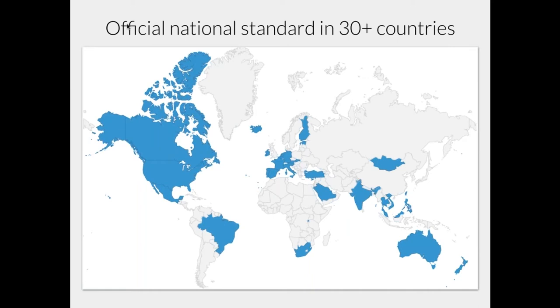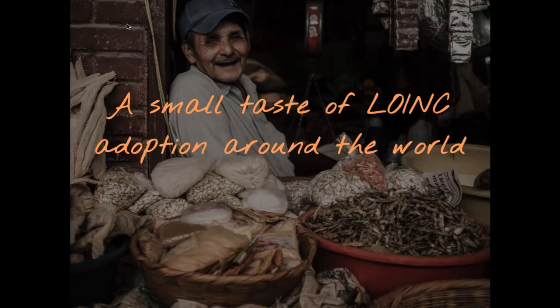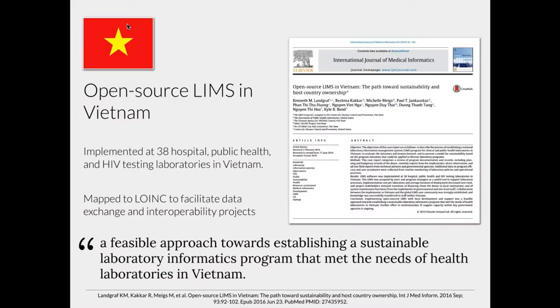In Thailand, the Thai Health Information Standards Development Center has been a promoter of LOINC and its use within Thailand over the course of, say, the last 5 to 7 years or so. And recently, I think at the end of last year, they came out with an overall report and set of recommendations around e-health in Thailand with a big focus on LOINC. Inside of this report are a couple of studies where they summarize the content coverage: does LOINC cover the tests that we are interested in, and so forth. And overall, they summarized that adopting LOINC will facilitate EHR interoperability in Thailand.